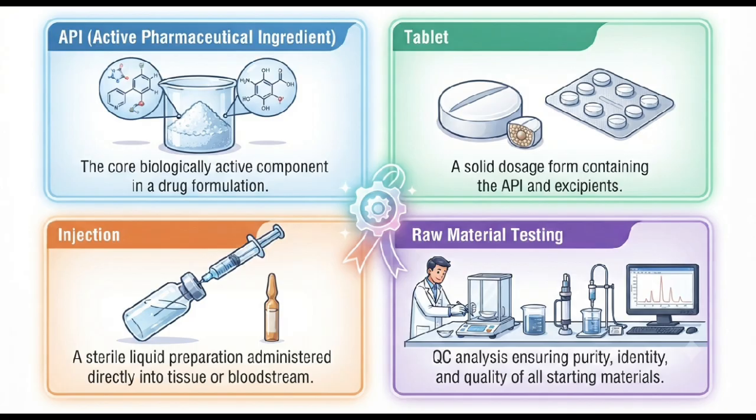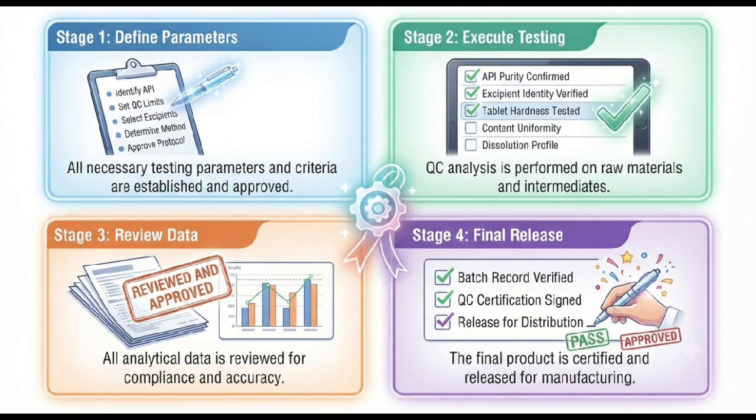Pharmaceutical applications. Titration has many applications in pharmaceutical analysis. It can be used for assay of pharmaceutical substances, determination of acidity or alkalinity, analysis of raw materials, standardization of solutions, determination of certain metal ions, and quality control testing of pharmaceutical products.